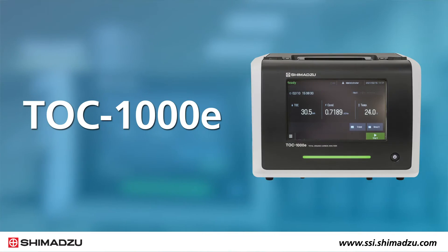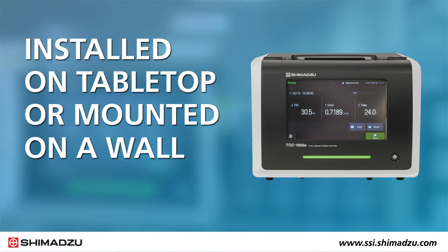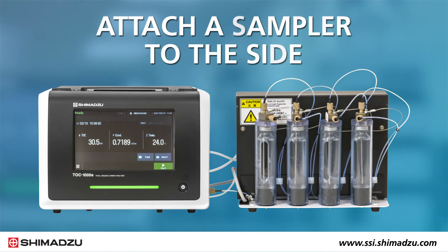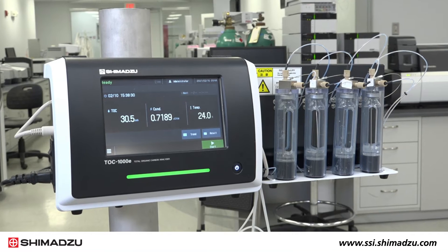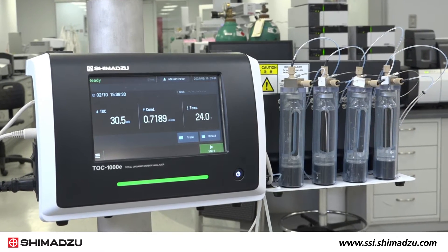The small and lightweight TOC1000E can be installed on a tabletop or mounted on a wall or pole using an optional bracket kit. You can also attach a sampler to the side of the instrument for on-site calibration, offering you the flexibility to install the instrument in the most convenient location for your needs.